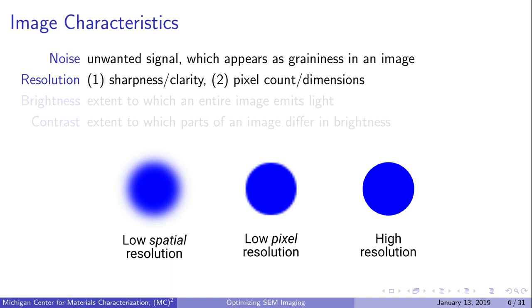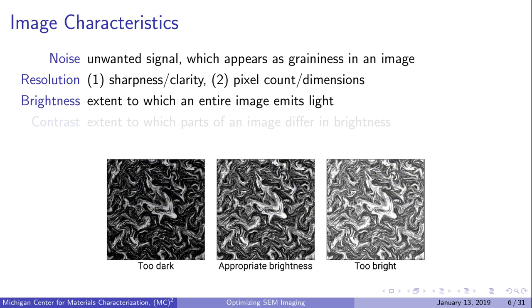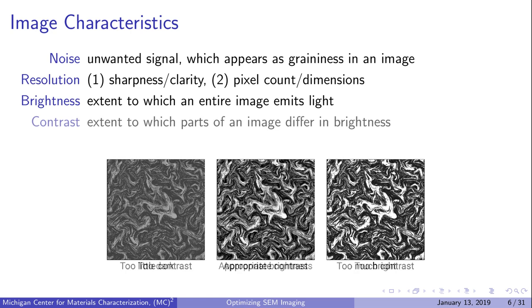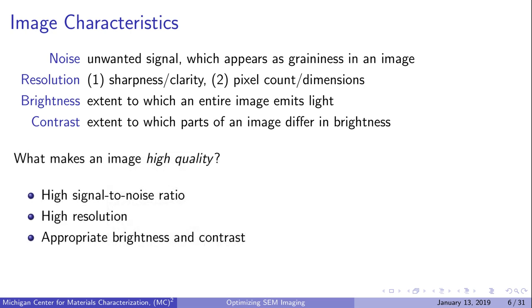The second definition of resolution refers to the pixel count or dimensions of an image in pixels. A common resolution for SEM images on our machines is 1280 by 1280, or 1.6 megapixels. Images with low pixel resolution appear pixelated at normal viewing conditions. Brightness refers to how much an entire image emits light—if too low, the image appears dark; if too high, it appears washed out. Contrast refers to how parts of the image differ from each other in brightness. For the best image quality, we want a high signal-to-noise ratio, high resolution, and appropriate brightness and contrast.